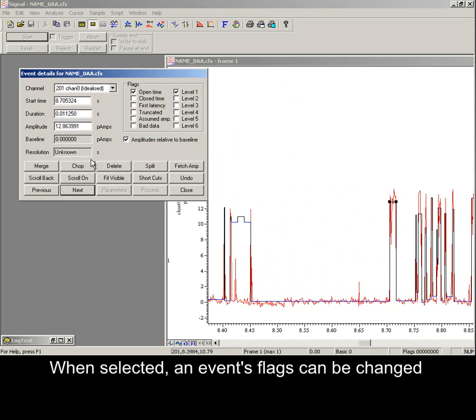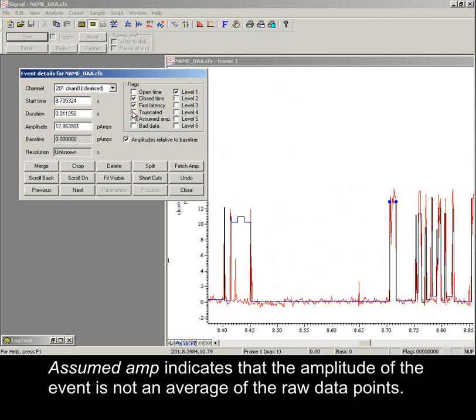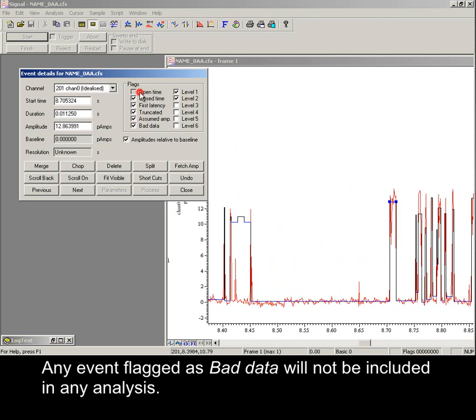When selected, an event's flags can be changed. Assumed amp indicates that the amplitude of the event is not an average of the raw data points. Any event flagged as bad data will not be included in any analysis.